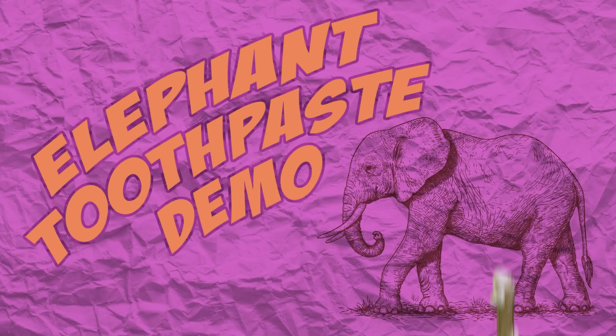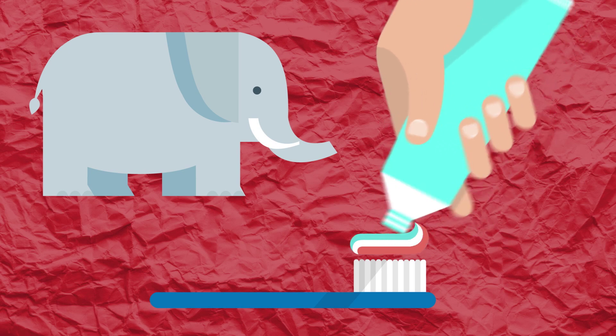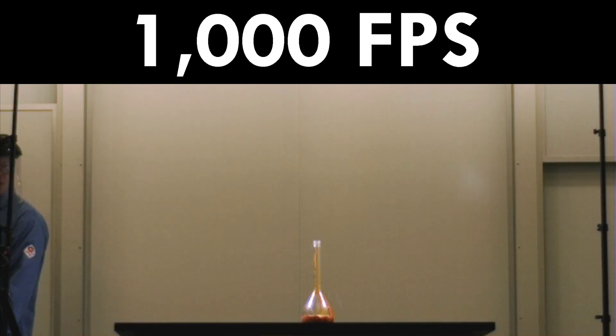This reaction is often called the elephant toothpaste demo, probably because an elephant needs a lot of toothpaste. Who cares? Here it is filmed at a thousand frames per second.